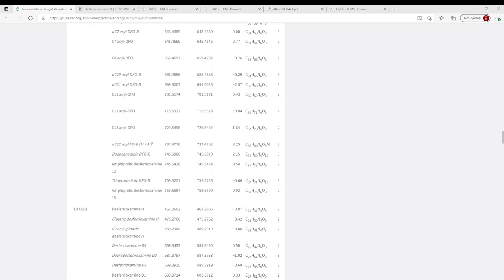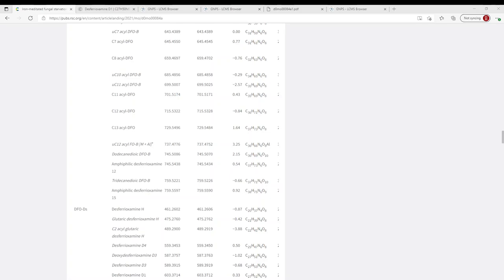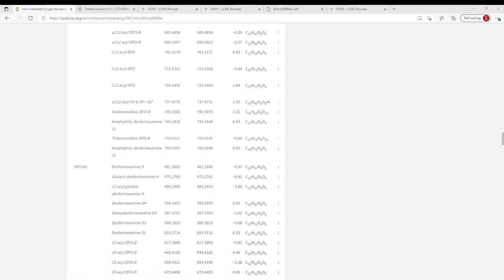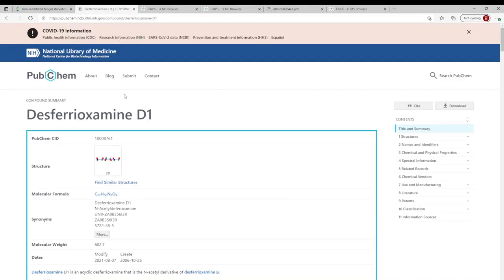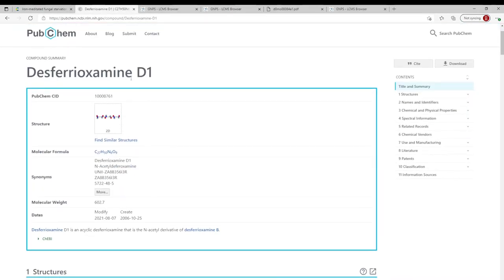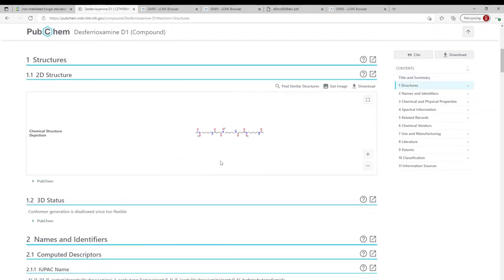We've all done this via vendor software, but it's also important GNPS dashboard can facilitate this, as well as lead into further tools on the GNPS platform. So let's take desferoxamine D1 as our example. We see here I have an exact mass, 603.3714. And of course we can match this to the PubChem record that's available, desferoxamine D1, and we have a structure.